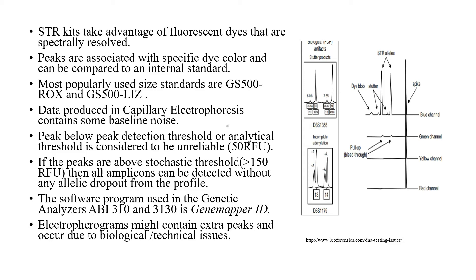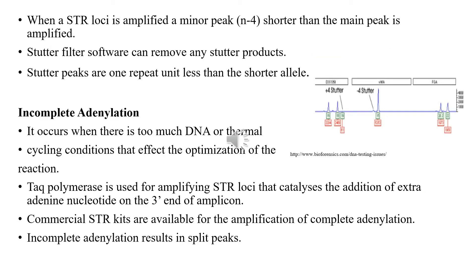When the STR loci is amplified, a minor peak shorter than the main peak is observed — these are called stutter peaks. Stutter peaks are one repeat unit less than that of a shorter allele. Stutter filter software can remove any stutter products.